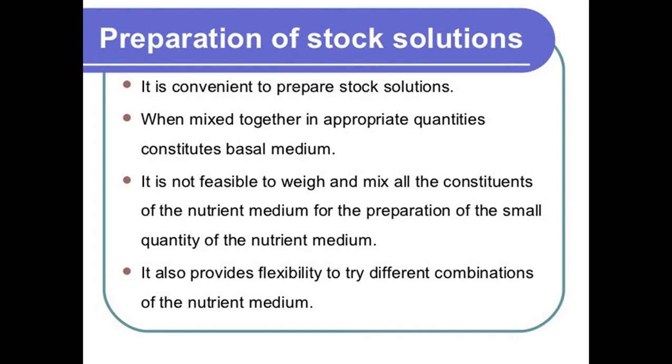So for preparation, we have to mix these different stock solutions together in appropriate quantities, and this is your basal medium. But it is not feasible to weigh all the constituents each time, so we have to prepare stock solutions of the macro and the micronutrients, so that we can use them in different combinations of the nutrient medium. We can use different stock solutions and different concentrations, so we can compare their results.